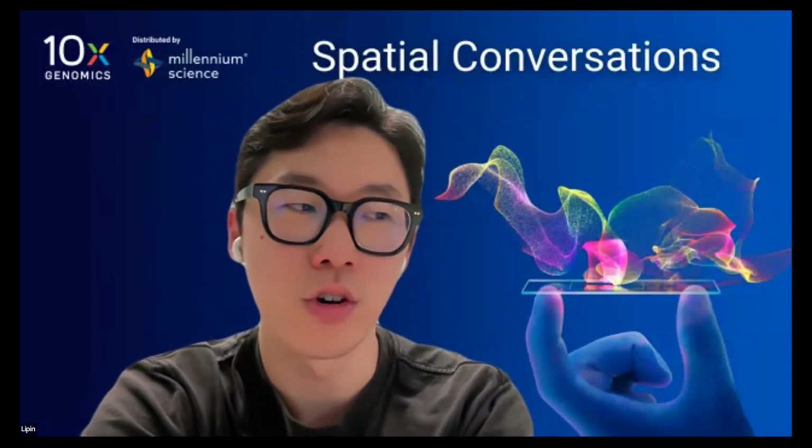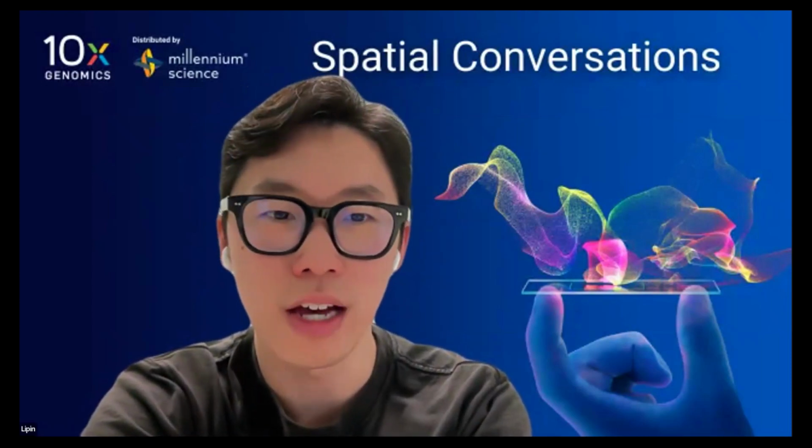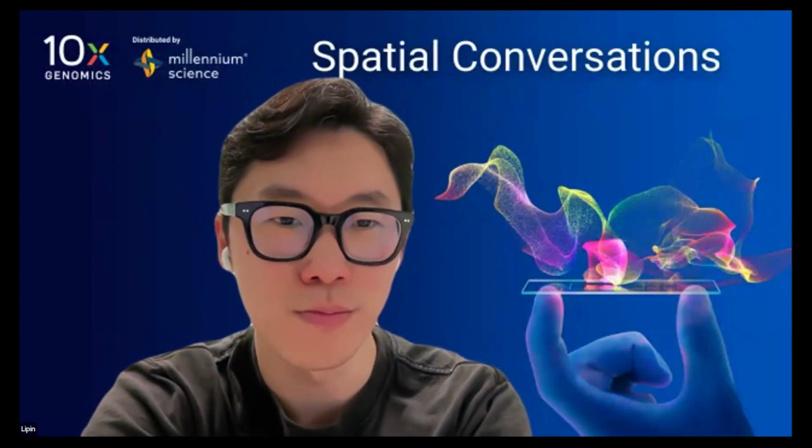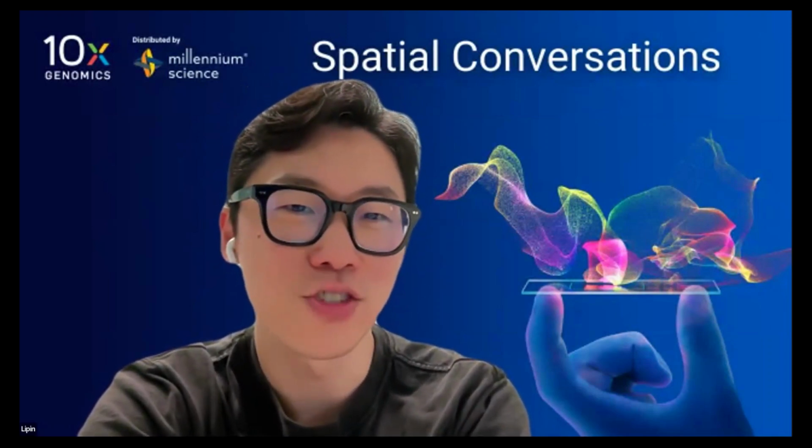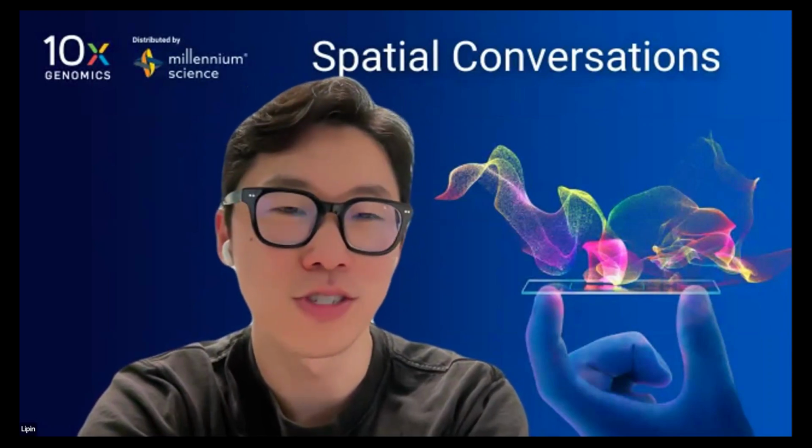Can I just add something real quick? People always ask me, why do you do Visium HD versus Xenium? Because Xenium now also has a 5,000 gene panel, right? Do you have an answer for that? Why should I do Xenium versus Visium HD?